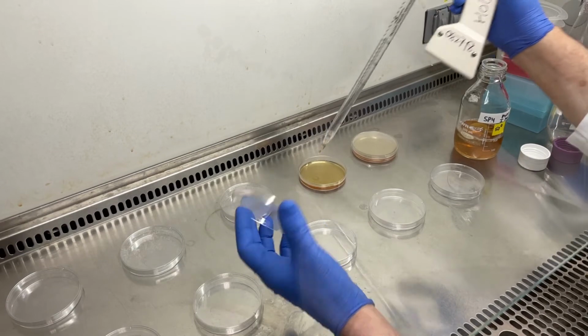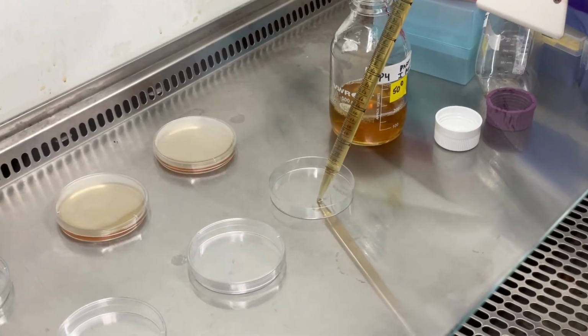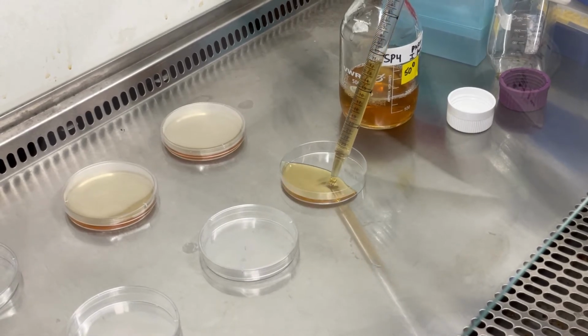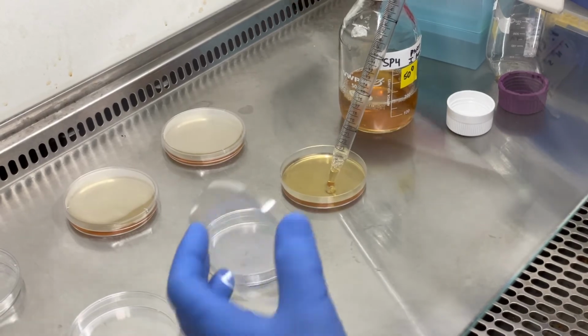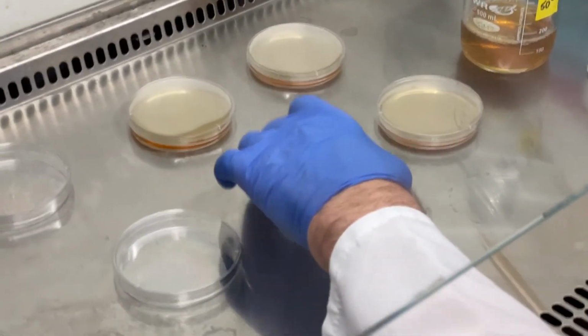Bubbles can be removed by letting them essentially float into the tip of the pipette. And we'll see a few cases of this. The reason for this is to avoid other methodologies for getting rid of bubbles. In other cases, with various plates, people will actually use a flame to break bubbles.